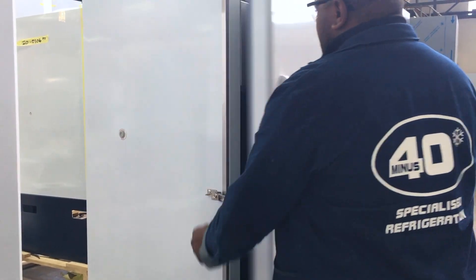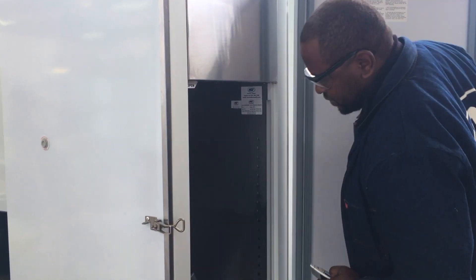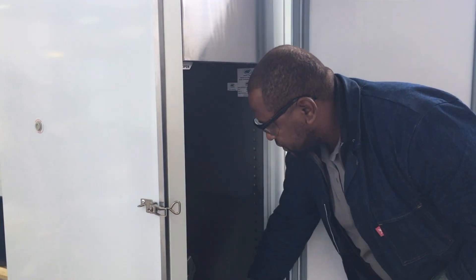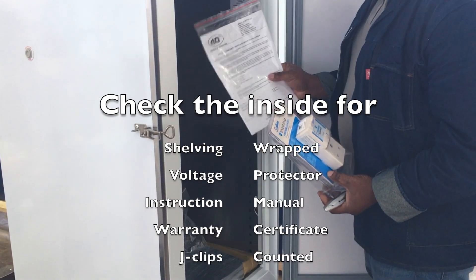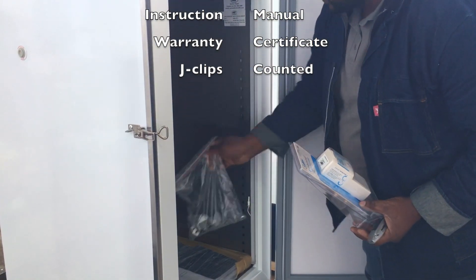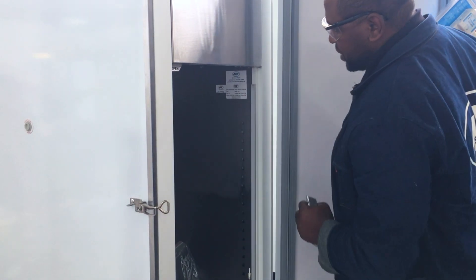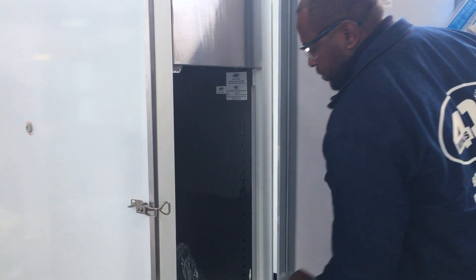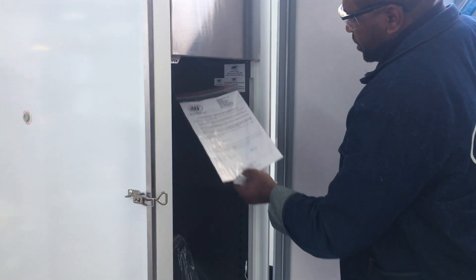Open your fridge and make sure that you have your shelves, your voltage protector, your instruction manual and warranty certificate, and your J-clips as well. You also have to check the serial number and make sure it is correct. The warranty certificate serial number has to be the same as the fridge's serial number.